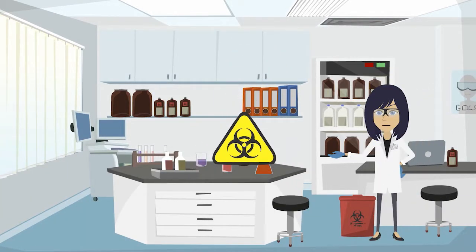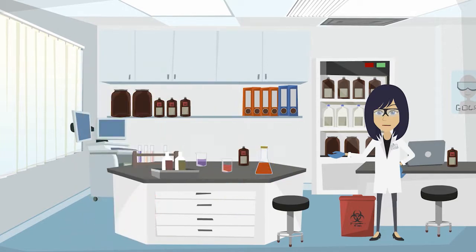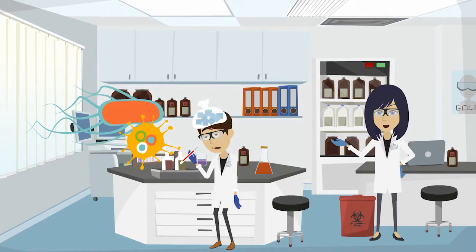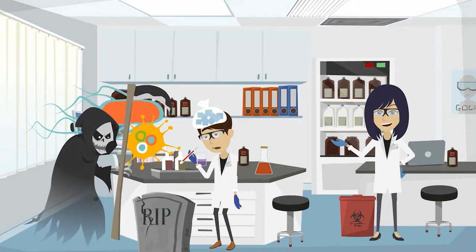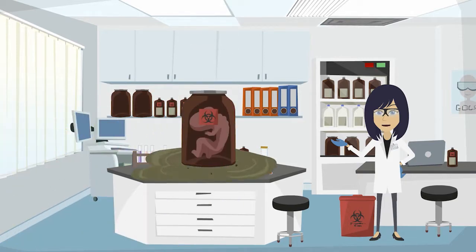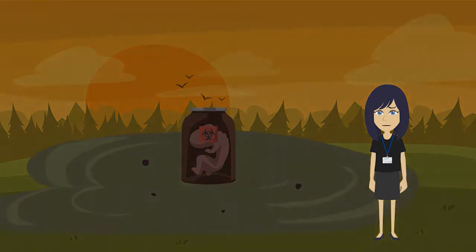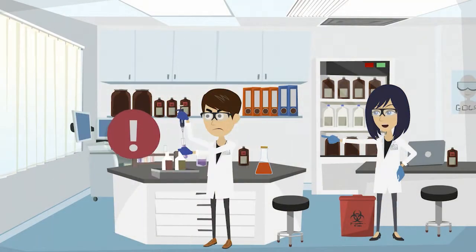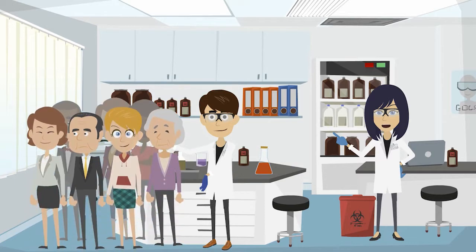Biohazards are substances that contain pathogens which pose a threat to organisms, as they may be zoonotic. They may be capable of replicating and causing an infection, especially the zoonotic, which can cause illness or death to both people and animals. If they contaminate work areas, or worse, spread beyond the laboratory, they may lead to unforeseen damages or outbreaks. For this reason, you need to be fully aware of the substances you are handling, in order to protect yourself, your lab, and your community.